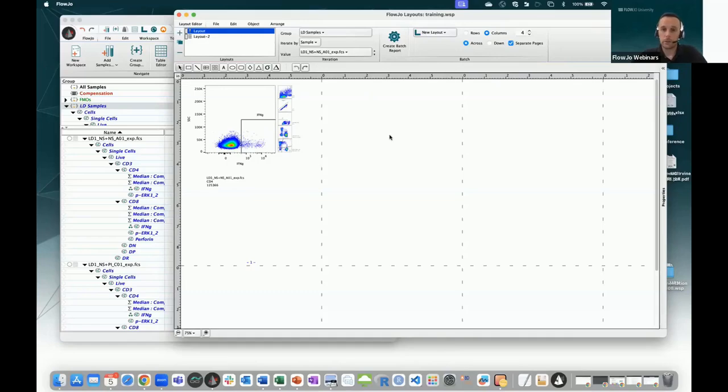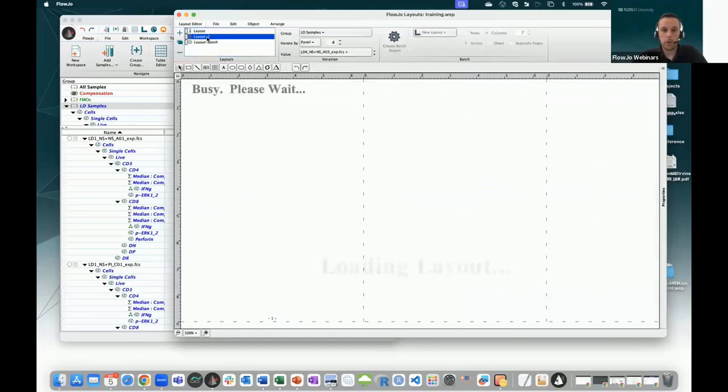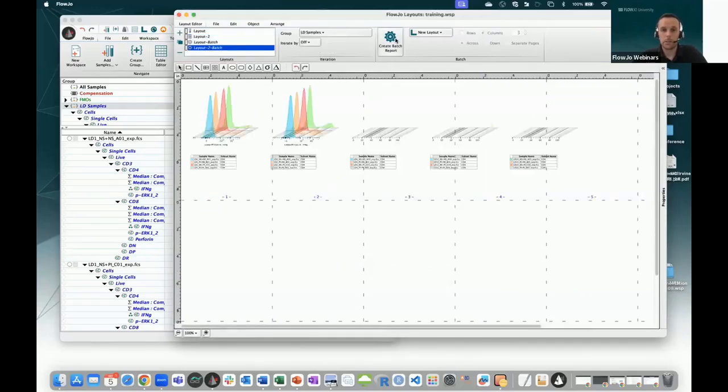Okay, everything looks good here, so I can batch. I can change, of course, my batch settings. Click on batch, get this unchanged, and I get my batch. My overlay, in this case, same as before. So take the first 4 samples, yes, so I can batch it and get the result.